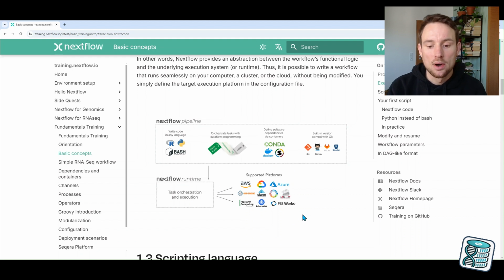There's support for a number of cloud platforms and HPC environments. So if you're interested in scaling your bioinformatics on your AWS or on your Google Cloud platform, there's a lot of connections here. And if you have some specific cases, please feel free to shoot me an email if you have questions about how to orchestrate and scale bioinformatics pipelines. Happy to support you there.